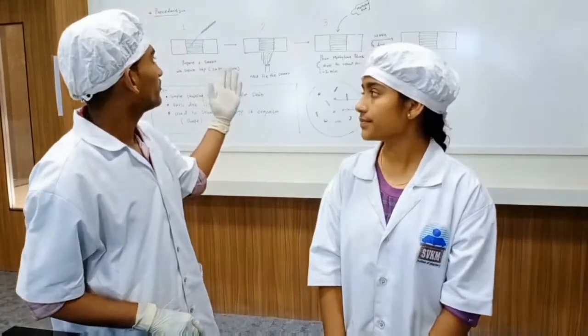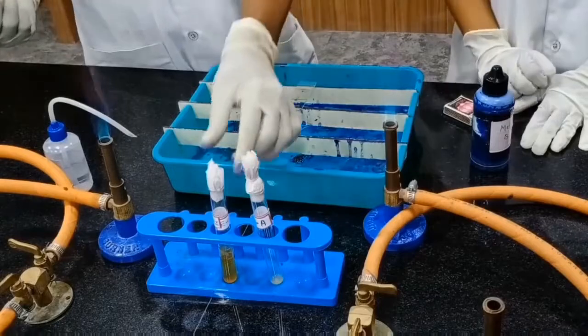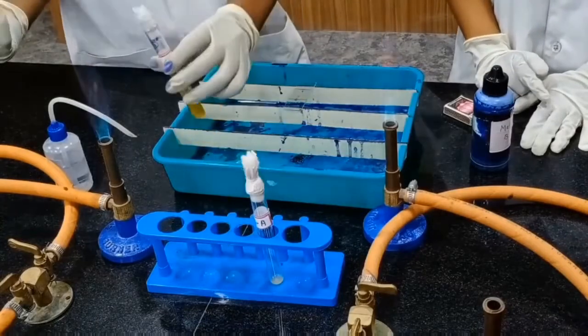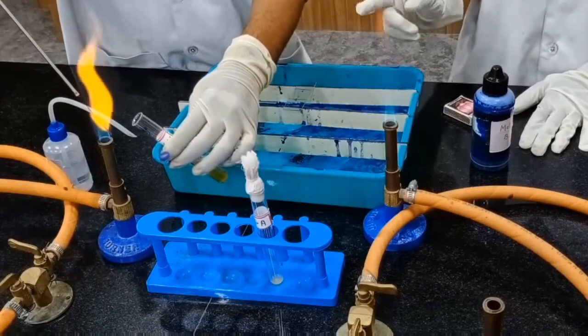So we are going to perform monochromatic staining of a given culture. First we have to prepare the smear, then heat fix the slide.